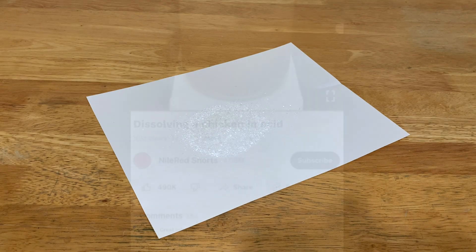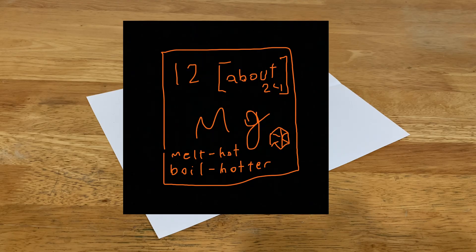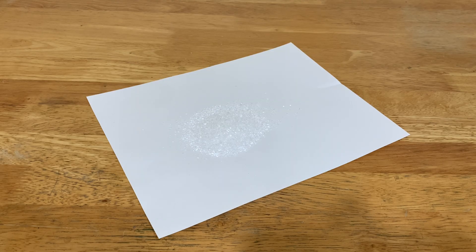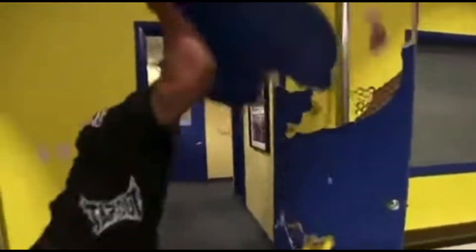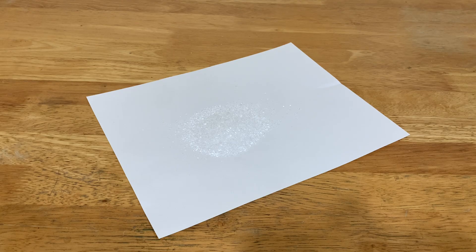But I can make sulfuric acid out of it, or magnesium if I'd want that. But today I want a method to make sulfuric acid which doesn't require a gamer PC as its power source. So yeah, sulfuric acid today out of Epsom salt. Let's go.